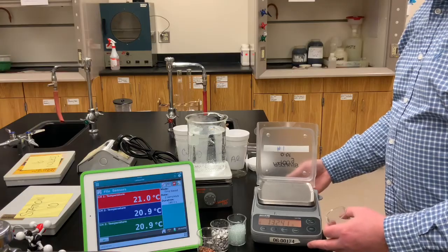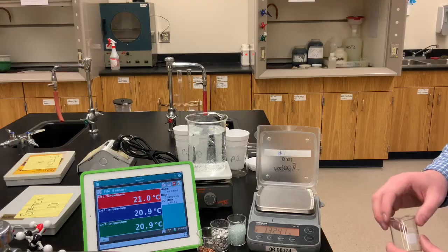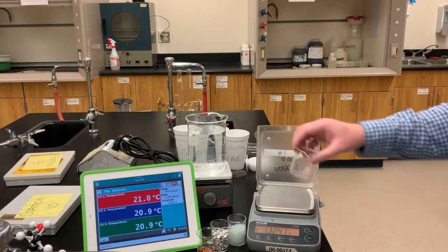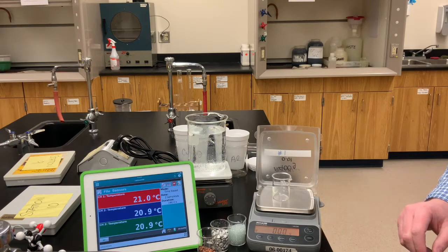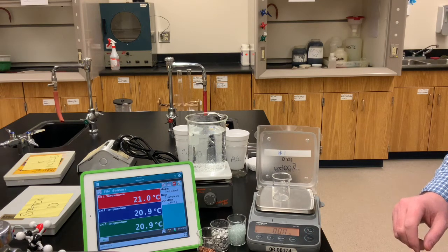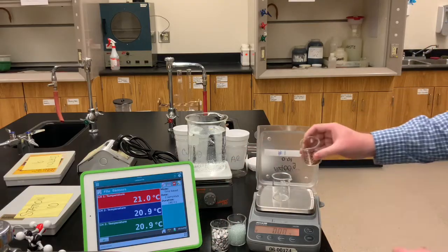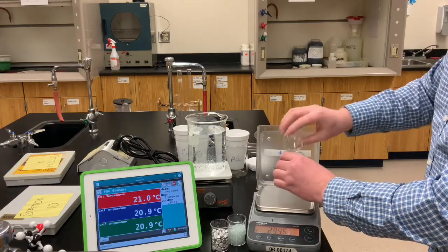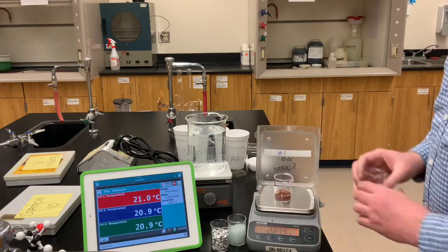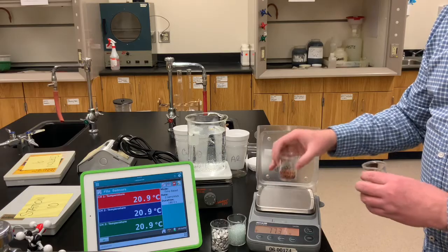We also need to record the masses of the three solids. I'll put a beaker on the balance and zero it. Let's take the copper shot and add that to this beaker. Record for yourself the mass of the copper we're going to pour into its calorimeter.